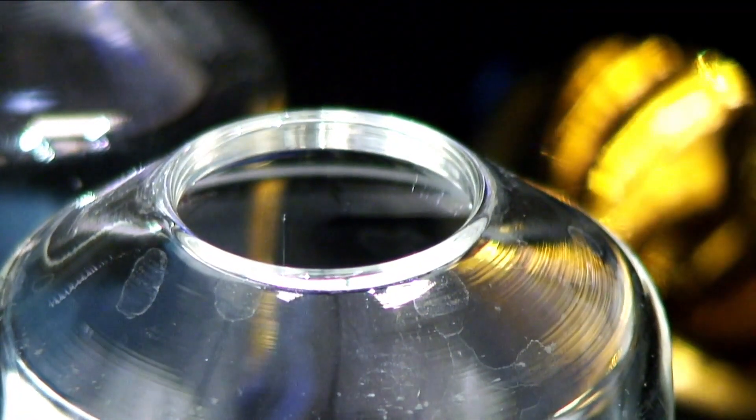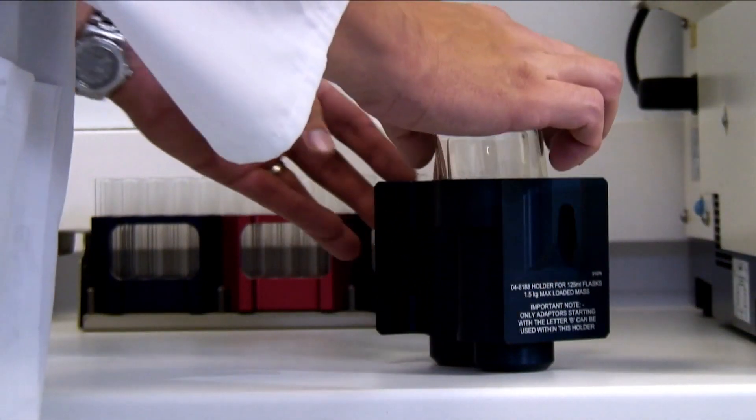Alternatively, if using a larger volume, Sample Genie may be used with a concentration adapter.